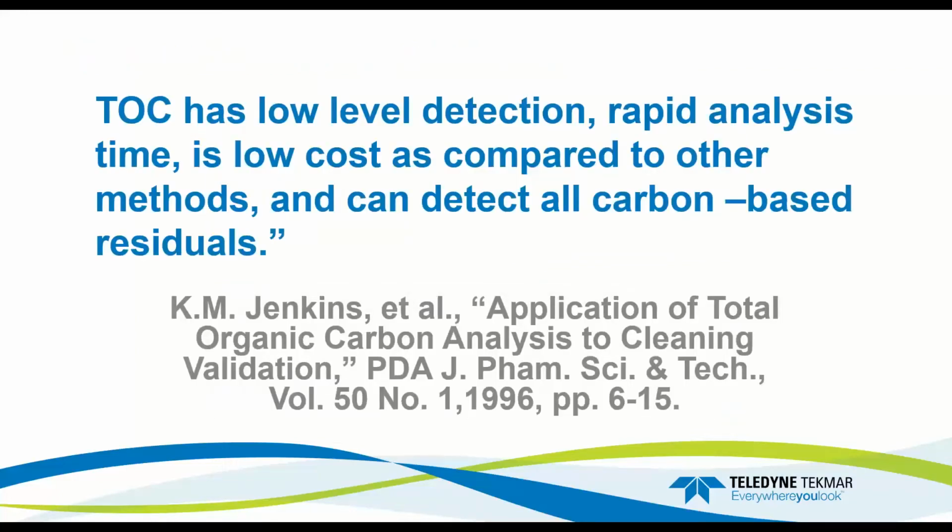As I said, over time, TOC has gained a lot of credit in the pharmaceutical industry. Here's a paper, for example: TOC has low-level detection, rapid analysis time, and low cost in comparison to other methods. A TOC system can be purchased for, let's just say, less than $40,000. When you look at an HPLC mass spec or HPLC UV-vis, the value of that system is going to be more than $50,000, depending on what type of detector you put on there.